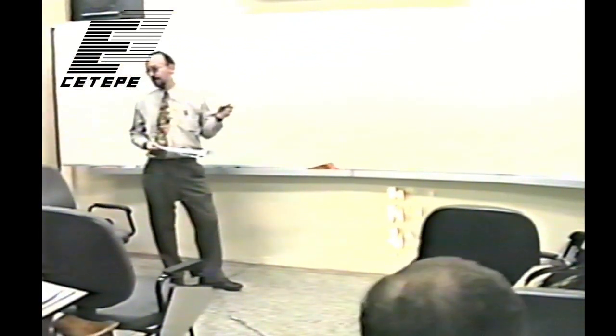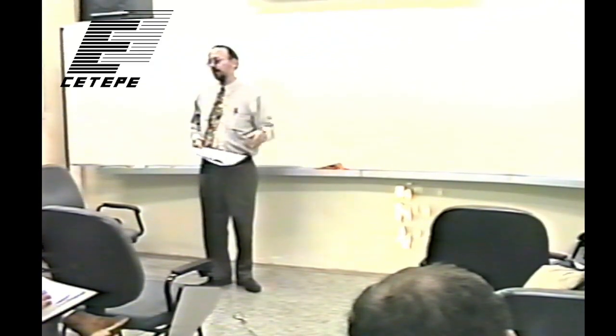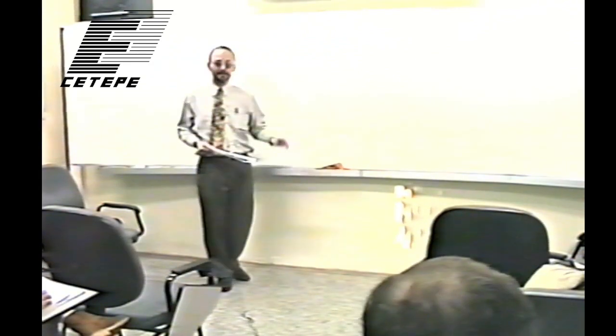in clinical medicine. And for some of the more exotic scientific stuff that I'll show you, where we try to use very low energies, less than 10 keV, then we might be talking about several angstroms. And there's a very interesting band of wavelengths for biological microscopy, X-ray microscopy, which happens to be between 22 and 44 angstroms. So these are very, very low energy X-rays, about 200 to 500 eV. And I'll mention later on this week, maybe we'll get to it today, why the 22 to 44 angstrom wavelength region is very, very interesting in biology.